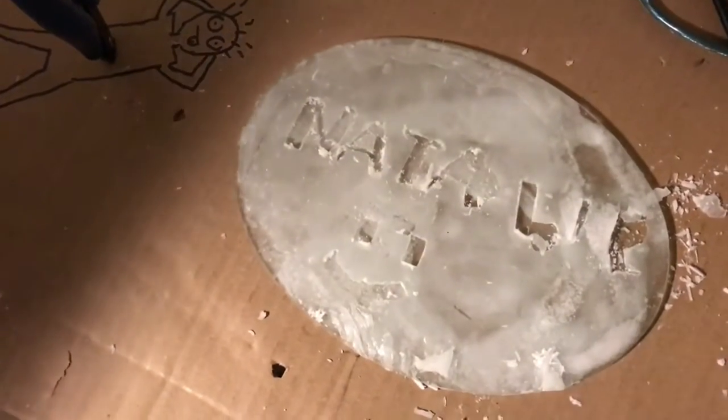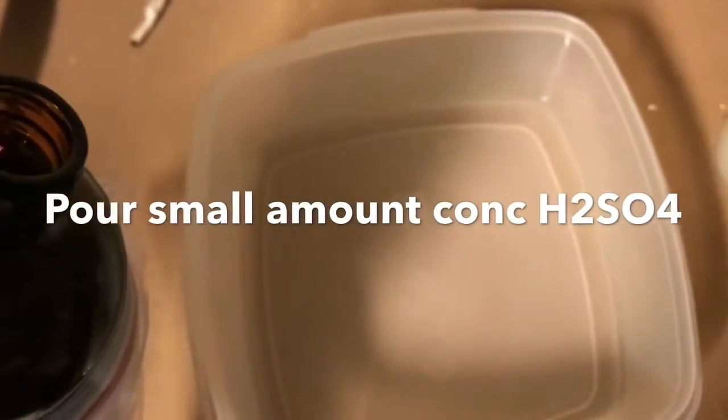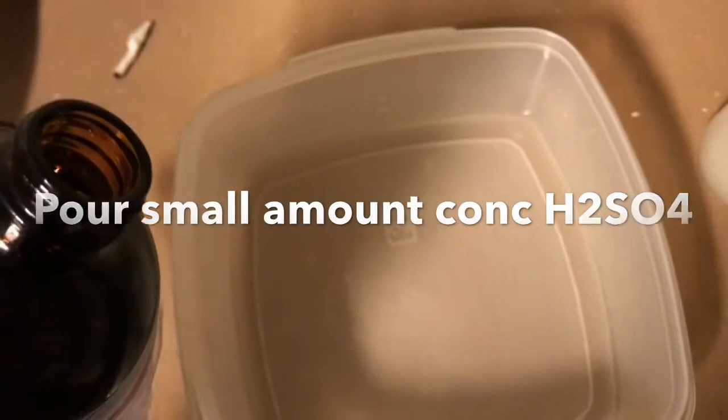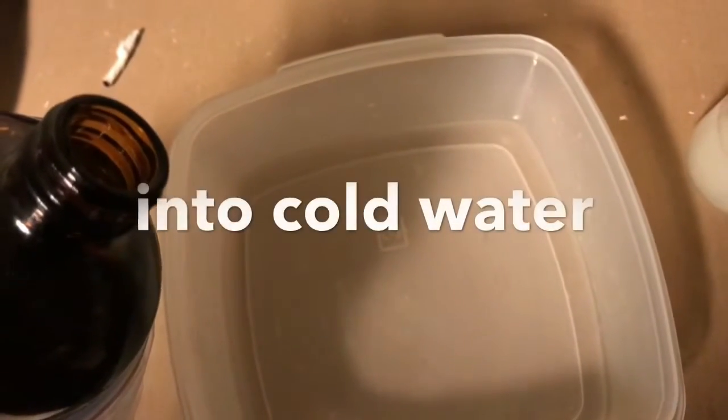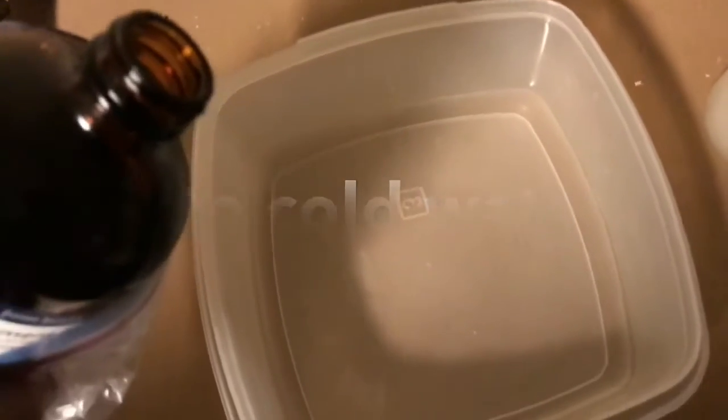Okay, now for our test run. This is concentrated sulfuric acid and I'm going to pour it into water. Never do it the other way around. Always the acid into the water and not the water into the acid, otherwise the whole thing would explode in your face.